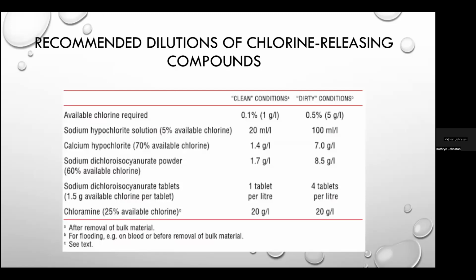Sodium hypochlorite, chlorine, is a fast-acting oxidant and a broad-spectrum chemical germicide. It's widely available as bleach, which is an aqueous solution of sodium hypochlorite. When used as a general all-purpose lab disinfectant, bleach should have a concentration of 1 gram per liter available chlorine, and a stronger solution, 5 grams per liter available chlorine, is recommended for dealing with biohazardous spills, such as blood spills.